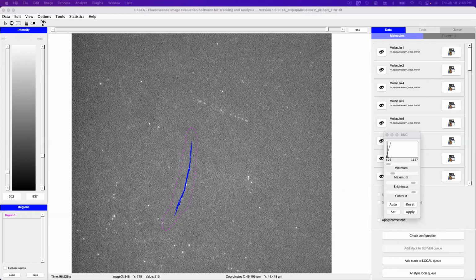So basically there are two versions of drift correction. You have your version from Joe's code that does the drift correction on the movie. So you bring the movie back, instead of analyzing after we get the precision. In this Fiesta, it does not modify the movie, it just changes the result.